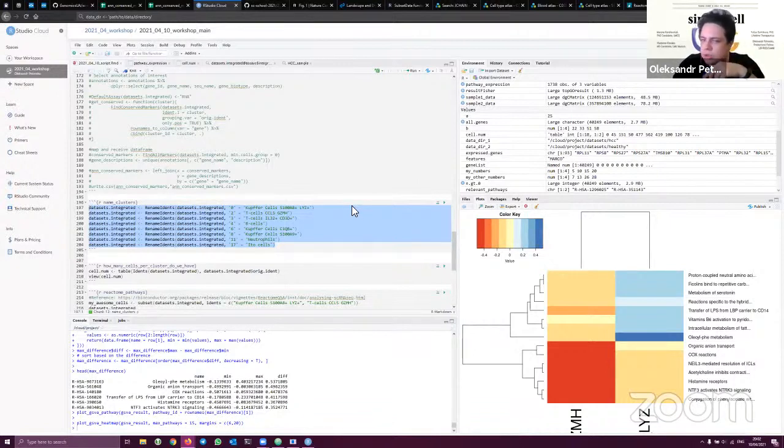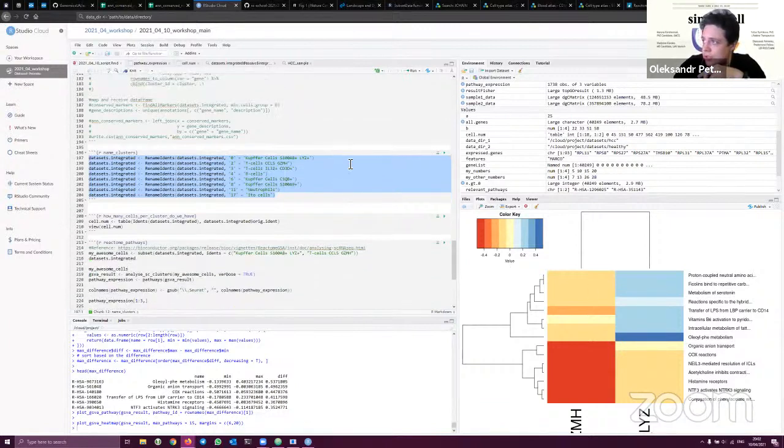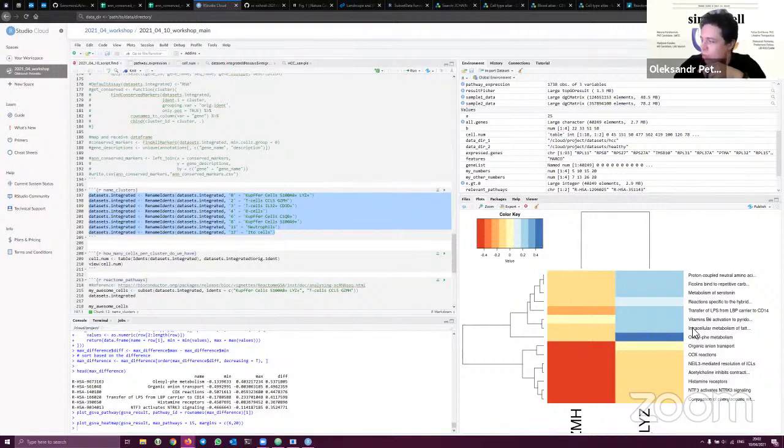But I would say it could take around 1 hour with the database, and also try to distinguish them as precisely as possible. Like if you see different T cell markers, just try your best guess and identify which exactly these T cells are, either memory cells or something, which may also require you to search the literature. Then make the pathway analysis and interpretation, so you will have more time at home. So maybe it's also nice in this case, for example, to Google about this pathway in the context of hepatocellular carcinoma. Maybe it's already known.